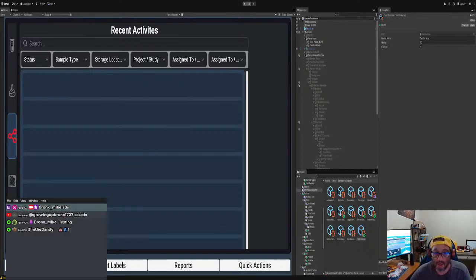All right, so here we go. So we put this here so we could find them in that menu that we just did, like here. I'll show you. So you see right here, create limbs, services, test, right? And that's in here. See, that's where we designated how we're gonna find it in the list. Okay.